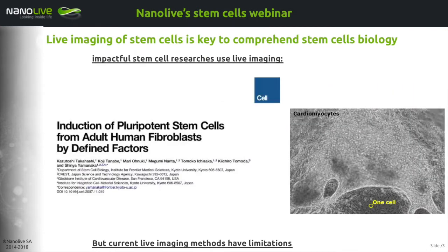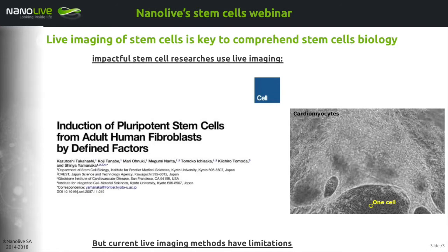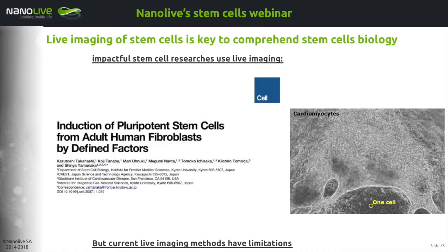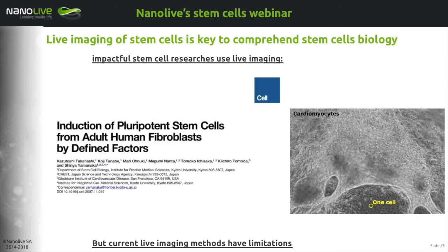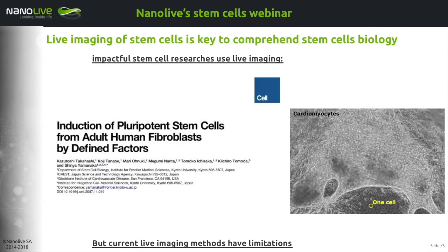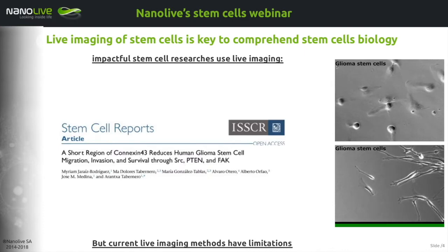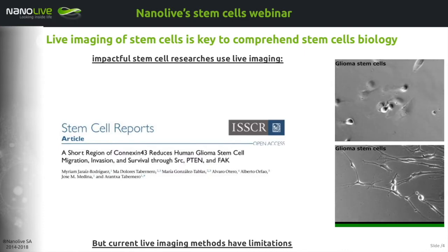Compared to fluorescence imaging, phase contrast requires much less injection of energy within the sample to obtain proper images of populations of cells — that is the definition of a less phototoxic approach. You can observe cardiomyocytes developing into a beating population of cells, which is quite amazing. It's taken from the famous paper by Yamanaka. You can also observe, at higher magnification, moving glioma stem cells.